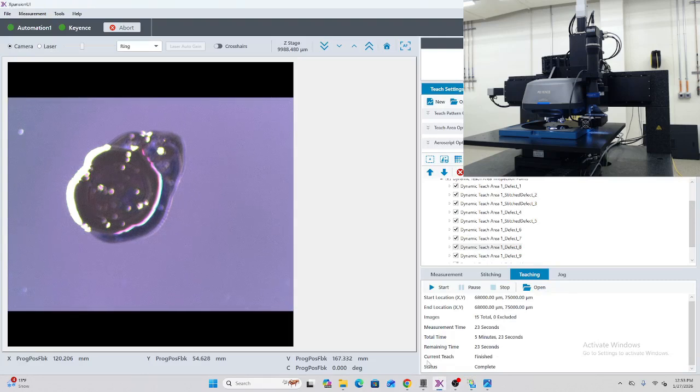So that's all I have for you today. Thanks for following along and learning how we automate the creation of inspection locations. We look forward to making your surface analysis process more automated and robust with the use of this tool and many others that we have developed alongside it.